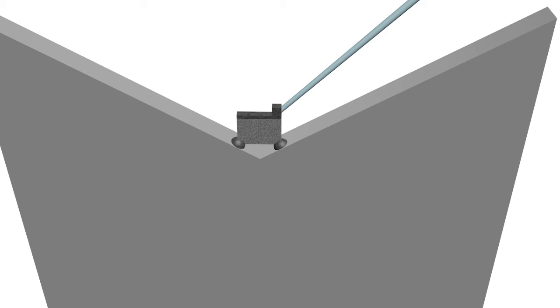Now, platinum is deposited on the contacts between the lamella and the holder, in order to connect the two.